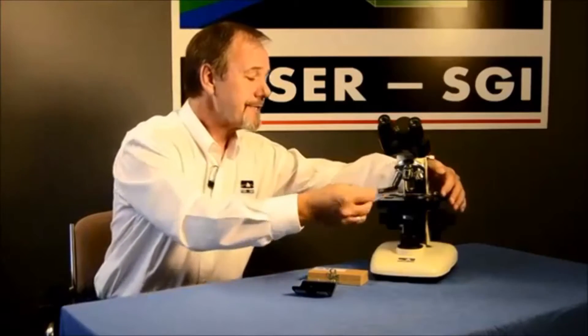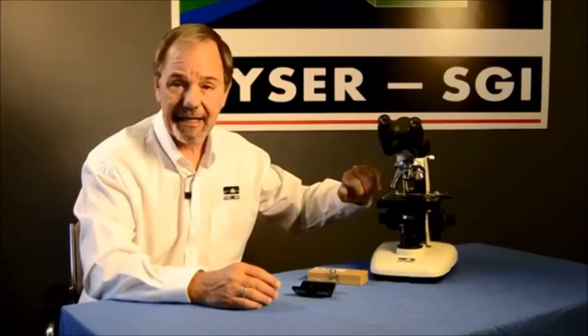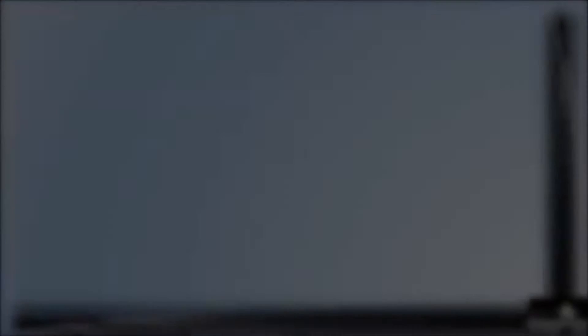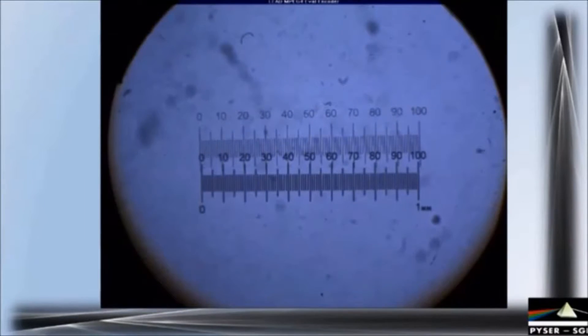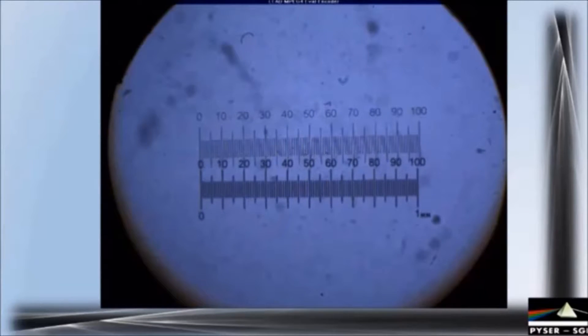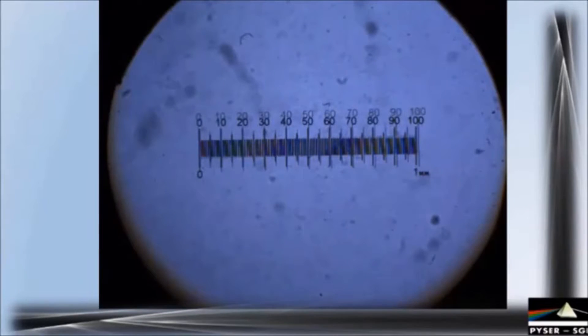All we need to do is put the stage micrometer onto the microscope in the normal manner, select the objective that we need to have calibrated, and then find and focus on the actual scale image. Some stage micrometers have a ring or target around the outside of the small scale to make it easier to locate. The stage micrometer scale can be seen moving as we adjust its position on the microscope stage. You will note that the 1 millimeter long micrometer scale is almost the perfect match for the 10 millimeter long reticule scale as it's magnified by the x10 objective. We align the scales one over the other so that the zero lines on the left-hand side are correctly lined up. The reticule scale is indicated in blue at the top and the micrometer scale in red at the bottom. However, looking at the bottom stage micrometer scale, it finishes earlier while the reticule scale is a little longer, so there is a mismatch or calibration error at this point.